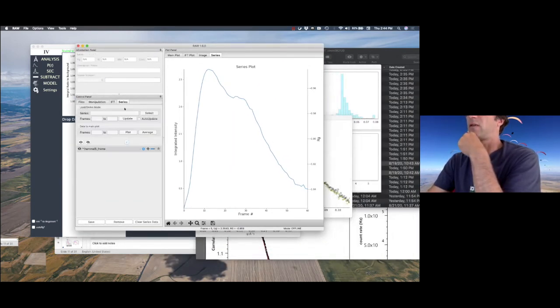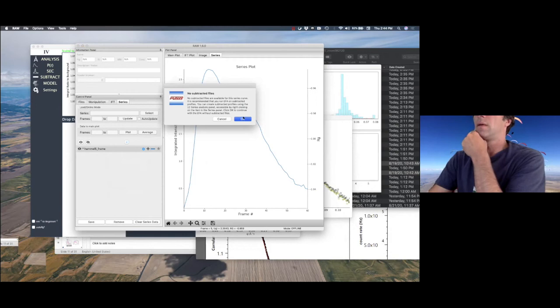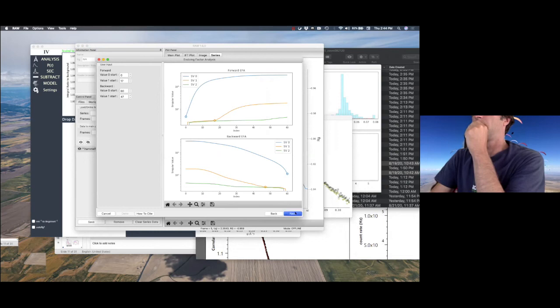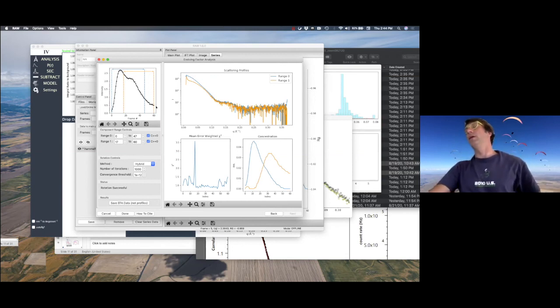That's a linear combination of each curve. This blue one and the orange one are a linear combination, and they contribute so much to each curve in the elution profile.